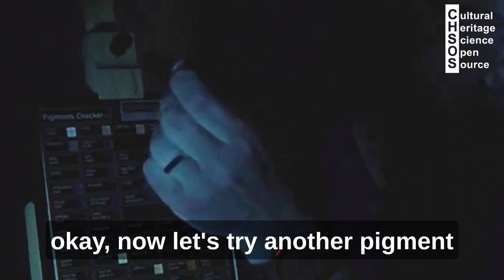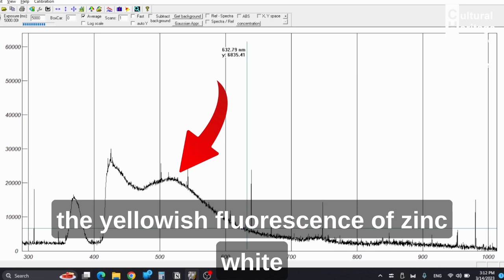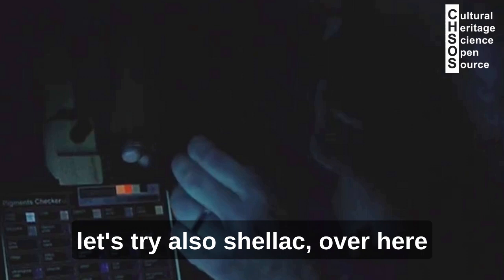Now let's try another pigment — for example, Zinc White, which is over here on the top. It is a yellowish color. We stay with the probe at about one centimeter and start the acquisition. Now we are looking at the yellowish fluorescence of Zinc White.